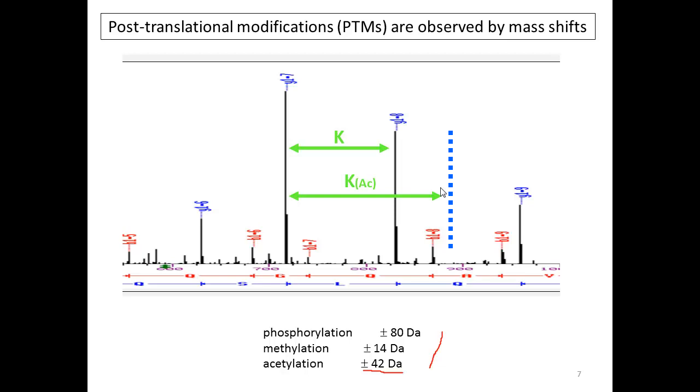So this has to be guarded against, and this is where a little bit of experience can help in the interpretation of these spectra. But again, fundamentally, the way we identify post-translational modifications is by observing increased masses in amino acid residues, and we ask the computer to consider those post-translational modifications which we think are most likely to be present at some time.